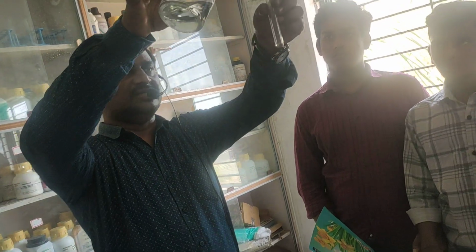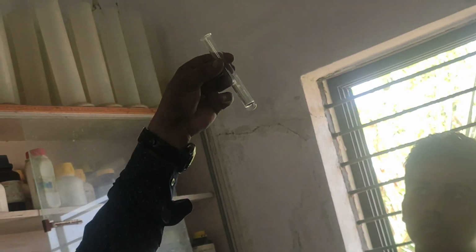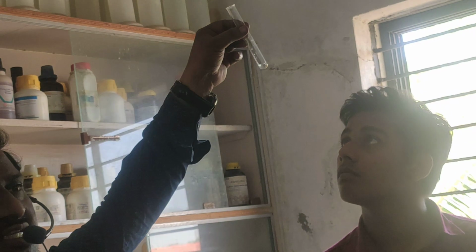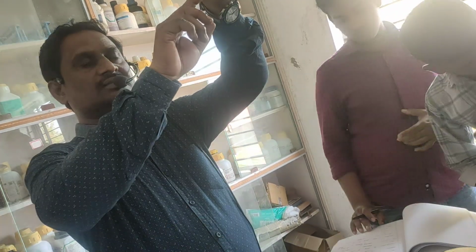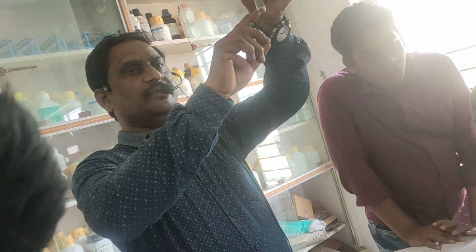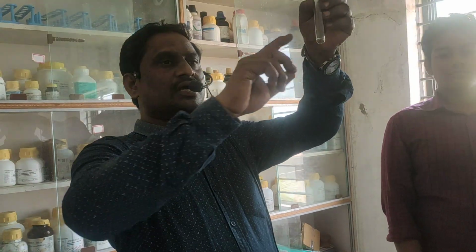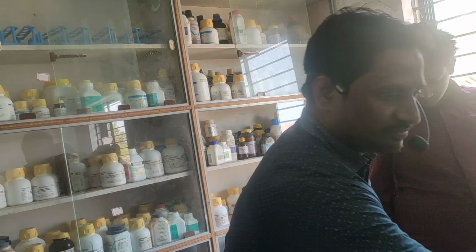So I am adding dilute HCl. See, I am adding the dilute HCl. Any precipitate? Precipitate means what? It does not get dissolved and settles down. That is called precipitate. Now you can't see any precipitate. First one, right? Original solution plus dilute HCl, no precipitate. Group 1 is absent.